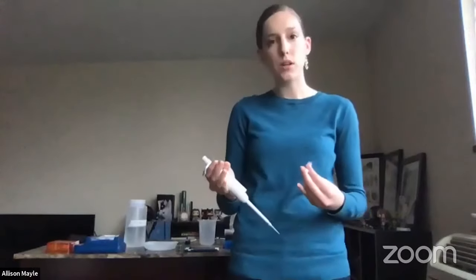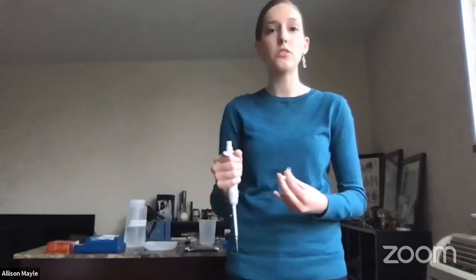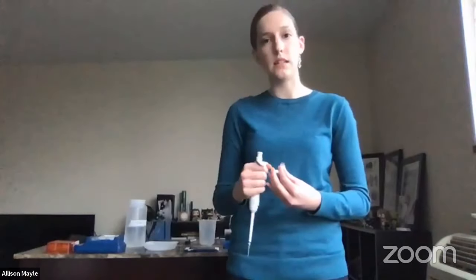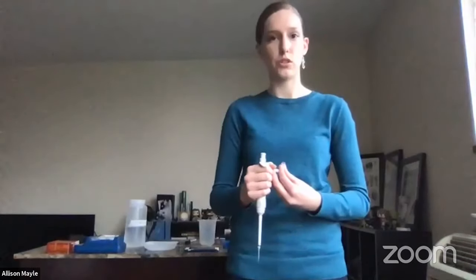Now the reason we wanna do this is when we're comparing our DNA samples, we wanna make sure that we're comparing the same amount so that we know that no differences are just because we've put a different amount of DNA into the gel. And also when we're setting up our restriction digestion, we wanna put the same volume of DNA in, we wanna put the same volume of restriction enzyme in. We wanna have everything exactly the same, except for who the DNA came from.